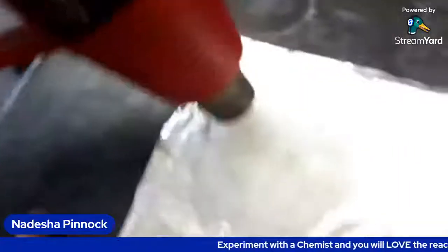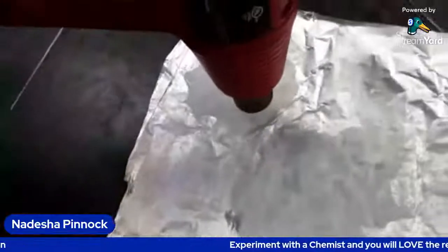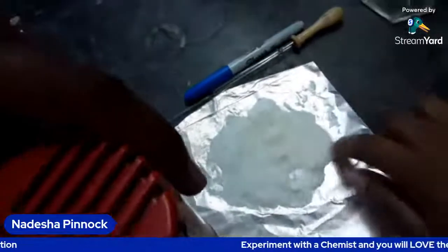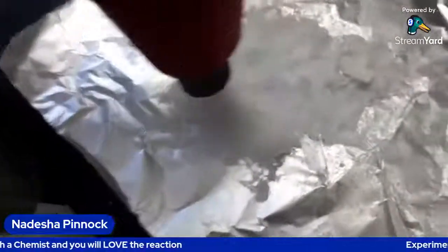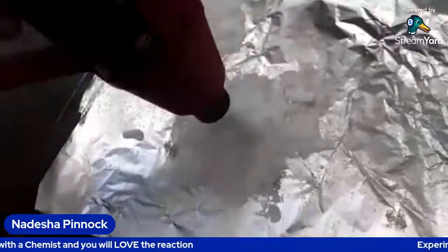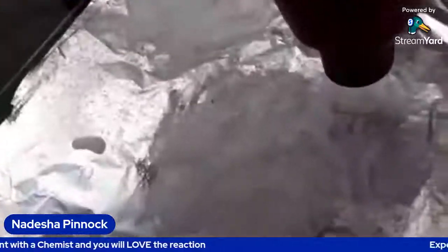And as I said, if you are doing this at home, you can just pop it in the microwave for maybe a minute or so. And it dries pretty fast. So it's gotten harder. We don't do this, guys, but it's very hot. We're drying this one as well. You can see the steam is already dry. This is the plastic burning.